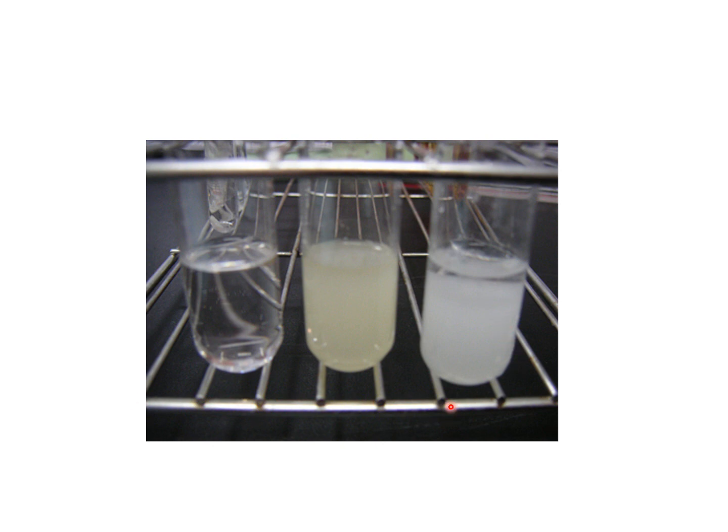This is the test result if the condition is carried out at room temperature, with no heating. So only at room temperature.